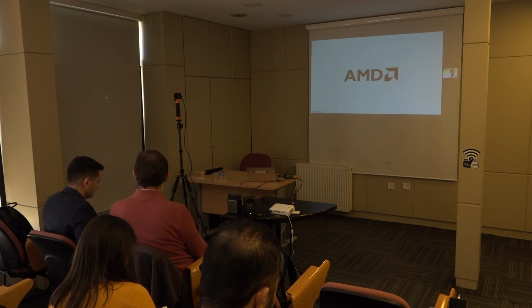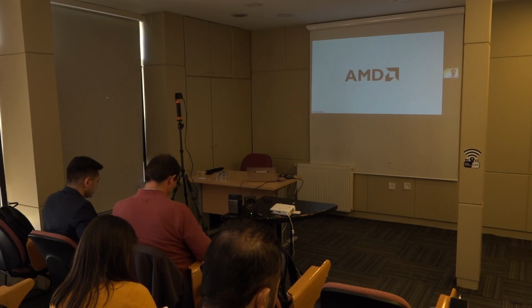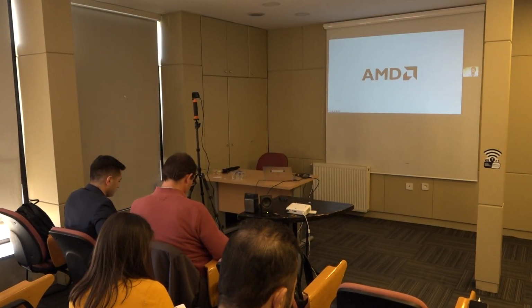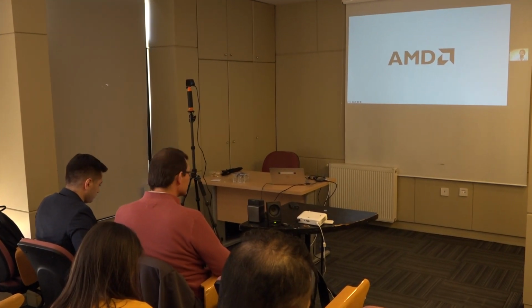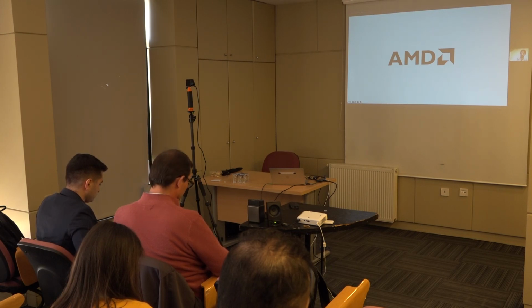First I'll mention why the accuracy is the same. When we were trying to develop an example basecaller, our goal was to keep the accuracy the same. It doesn't matter if we go for lower precision or we prune the model, and that's what we observed from the motivation slides which I showed, that we can really push the quantization and still keep the accuracy.